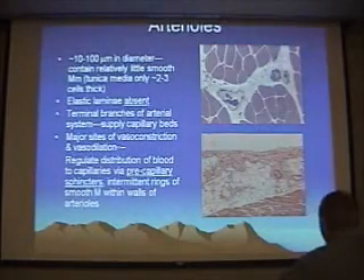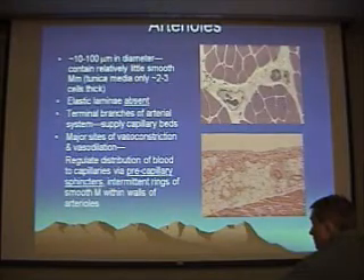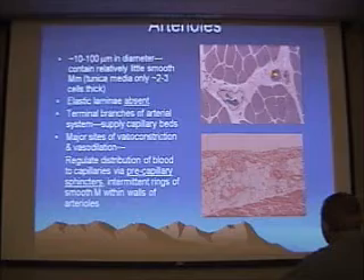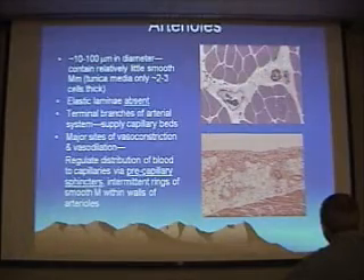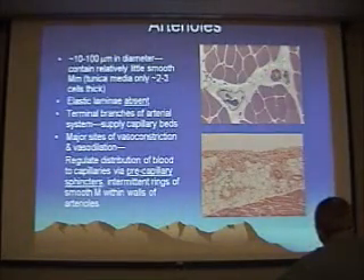When you get to arterioles, remember you're losing some of the key characters that you see in those larger vessels — you can start to lose your elastic lamina. So when you look at an arteriole — in this case, this one is constricted — this is a special stain, so the endothelium, the tunica intima, is kind of thrown into these folds. You can see the tunica media is a paler lavender — that's smooth muscle — and then the adventitia is just a little restricted bit on the outside.